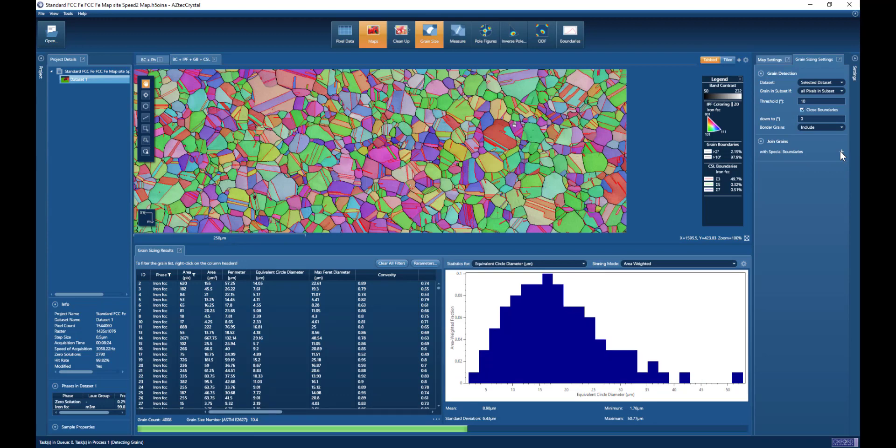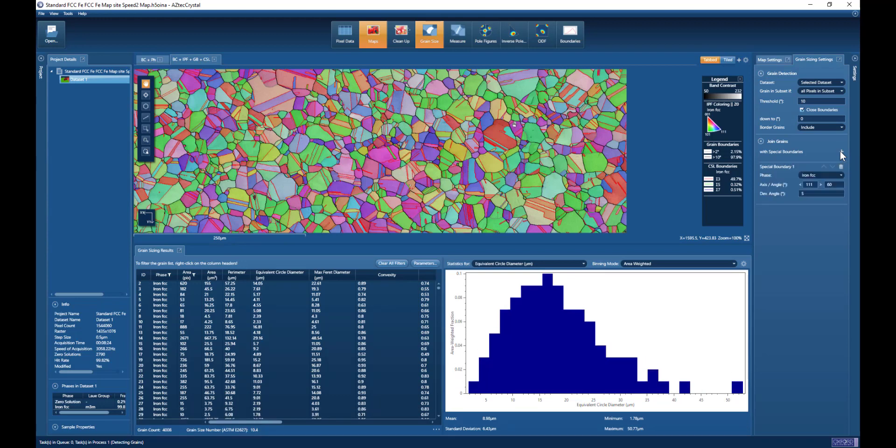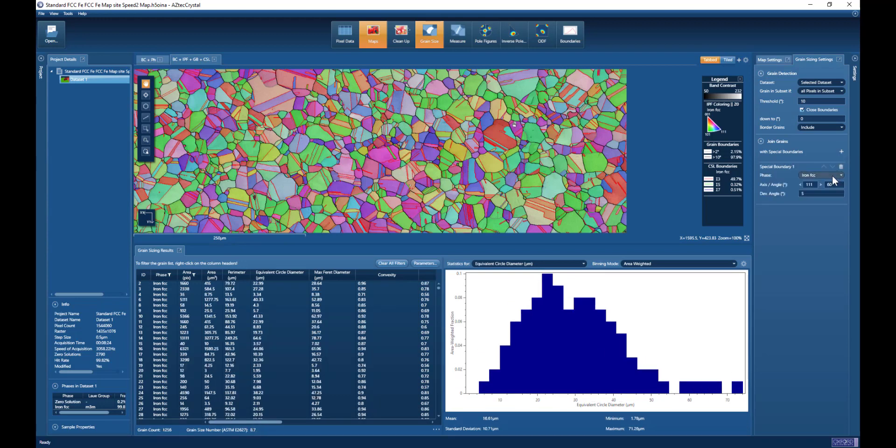I'm adding special boundaries. We have the default cubic relationship here, so 60 degrees around 111, applying to the austenitic ion phase.